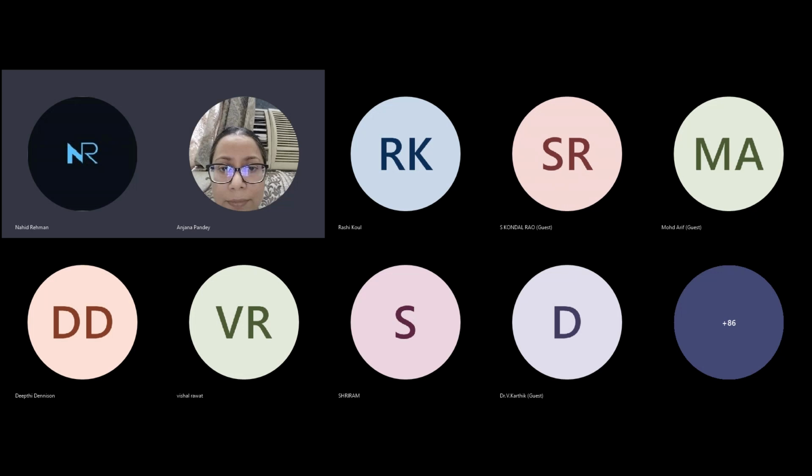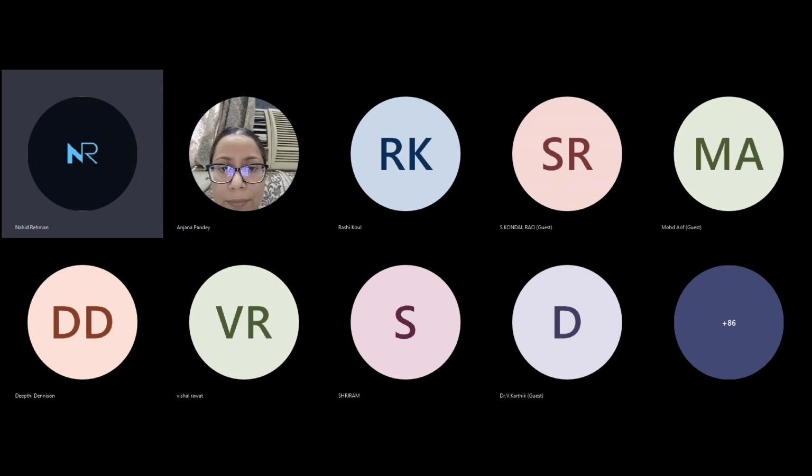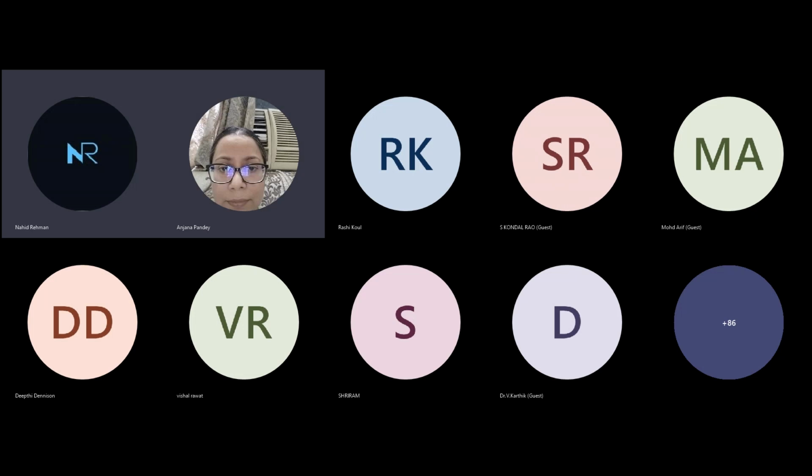And I will tell you with my experience, you can go in different stages. Because what happens, once the pH acidifies, pH goes down, hydrogen production is suppressed. In that case, you change the medium half and then put new supplementation. And then you will see that immediately the lag time of hydrogen production will be reduced, and immediately you will have a good amount of hydrogen. If you want to go for the continuous reactor, then you can maintain the pH.